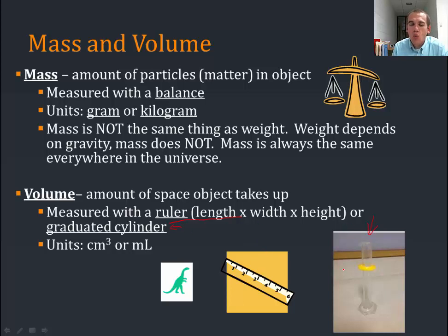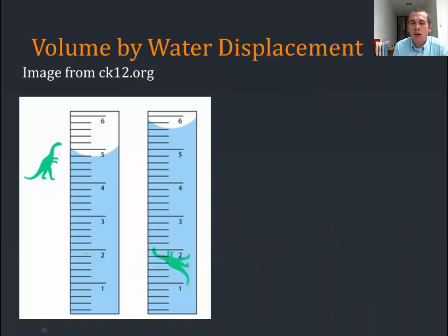That's this device down here. We usually use a graduated cylinder to measure liquids, but when we have irregular shaped solids, things that are not cubes or rectangles, we can also use a graduated cylinder to help us measure the volume of a solid. What we use is the water displacement method.